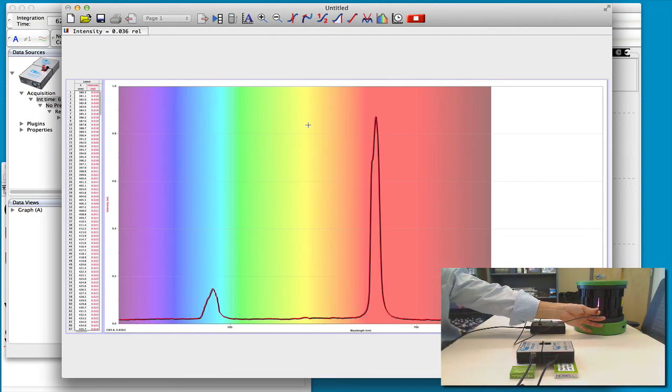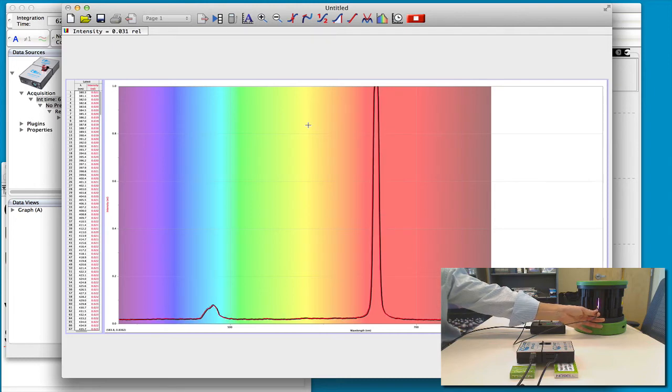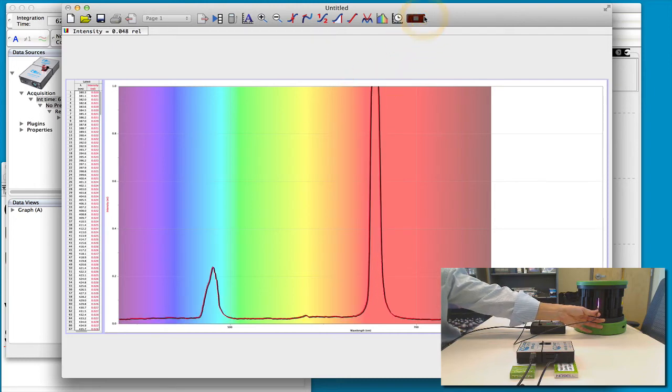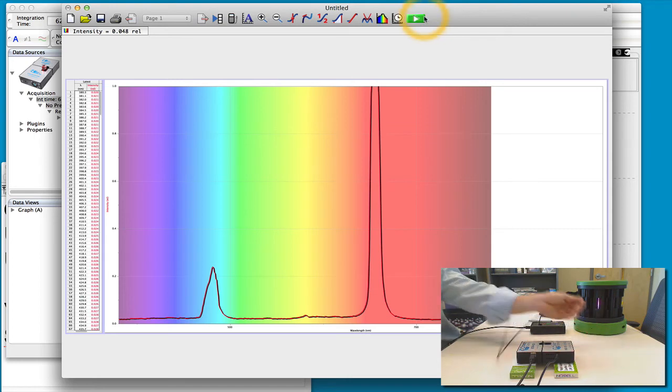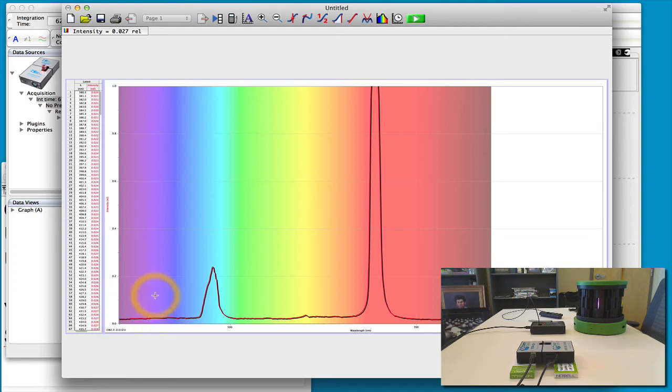And again you can start to see in this case you'll see that you only see two of the lines because this spectrometer, I'm going to stop it here, only goes from 900 only down to 380 nanometers.